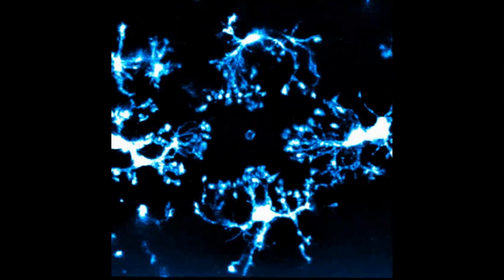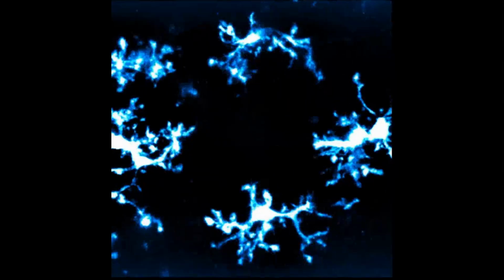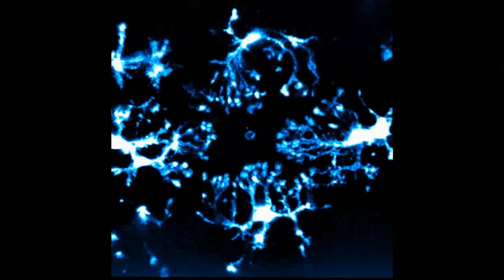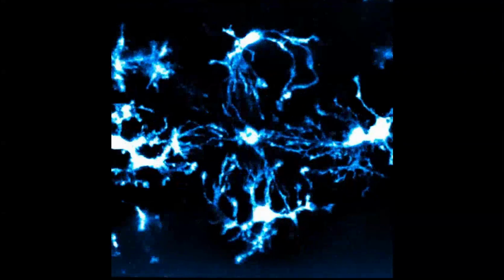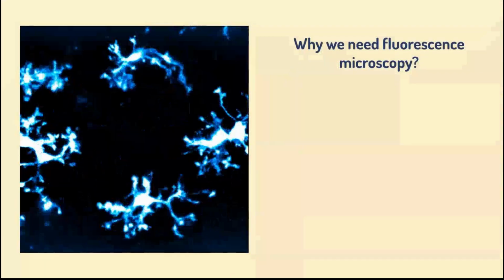This is an iconic image from the lab. I always put this image at the beginning of the talk because it represents many things. Not only that the cells move, but that the cells can react, and that with the fluorescent microscopy you can isolate them, because actually this is a part of brain tissue that is full of cells, full of extracellular matrix, for example, but here you're only seeing the microglia.